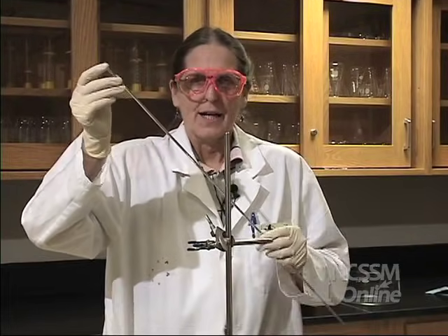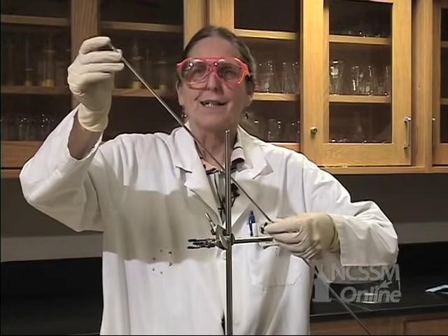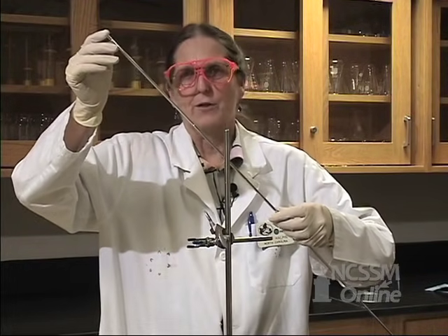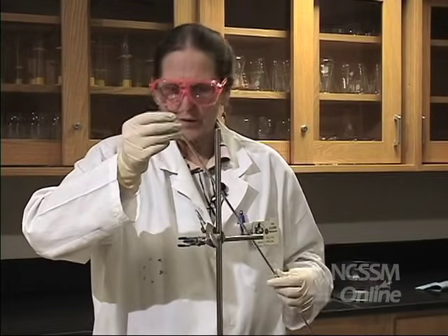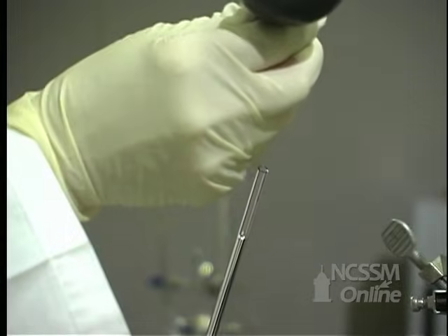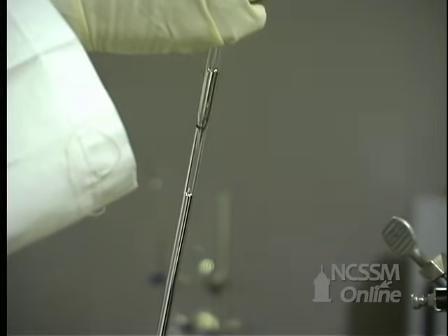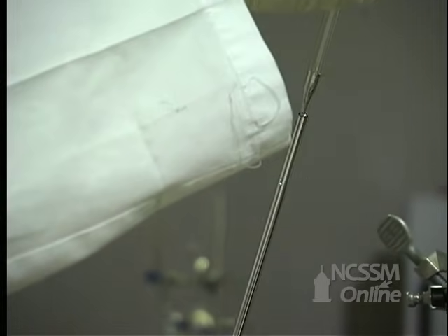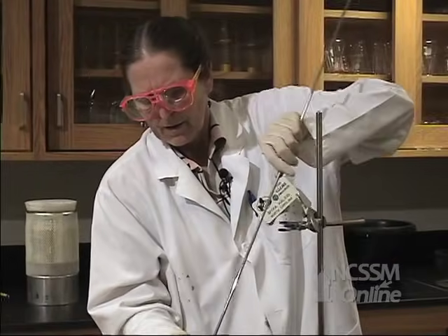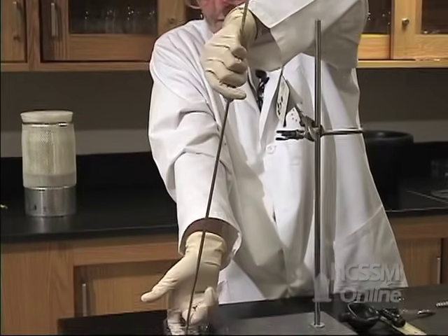We're going to make a barometer. What I have here is a glass tube that's about 800 millimeters long, and I've filled it with mercury almost to the top. I'm going to finish filling it so that it's filled all the way to the very top. Then I'm going to put my finger over the end and invert it into the mercury.